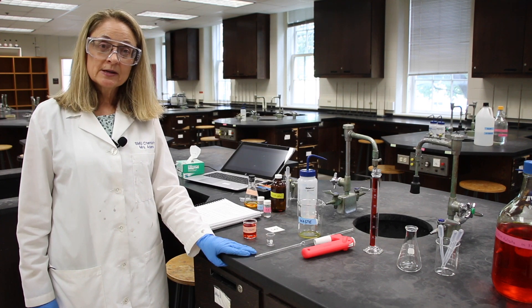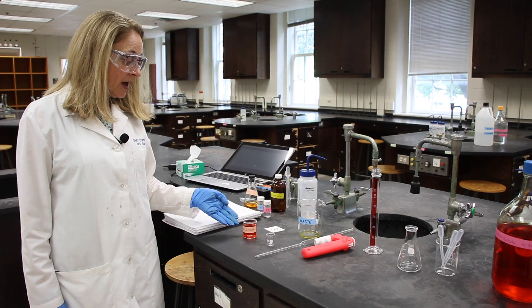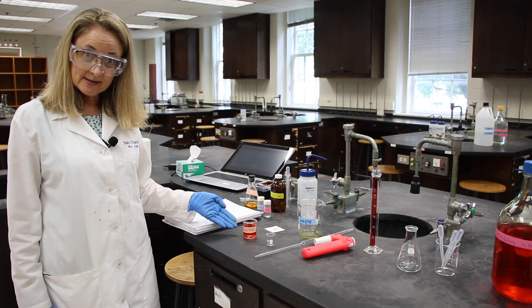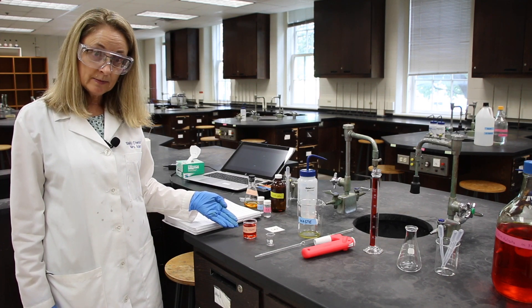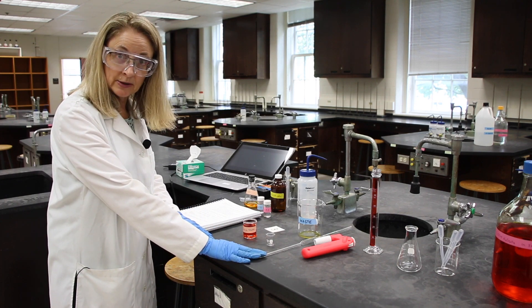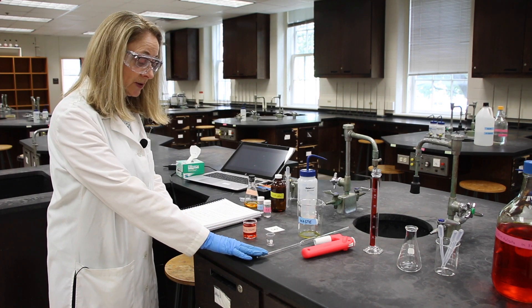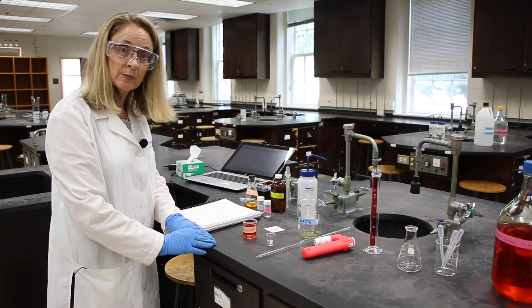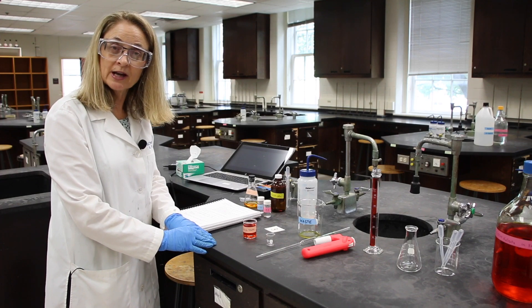The first step says to obtain some 0.125 molar potassium dichromate in a small beaker, then normalize a 10 milliliter pipette with that solution, and also to obtain some DI water in a very small beaker. I'll do that right now.